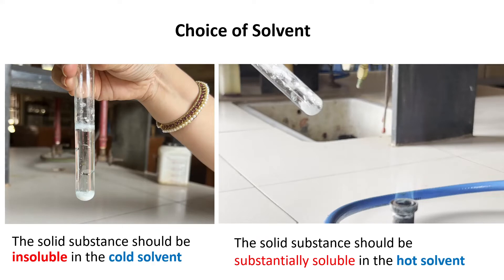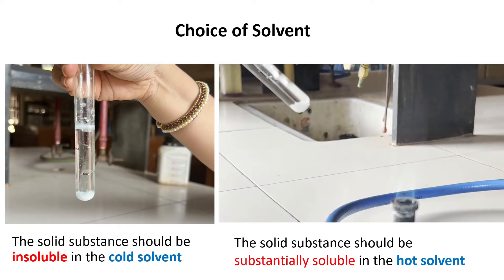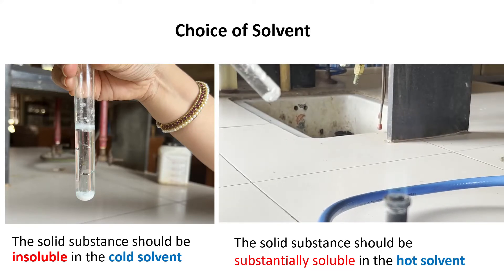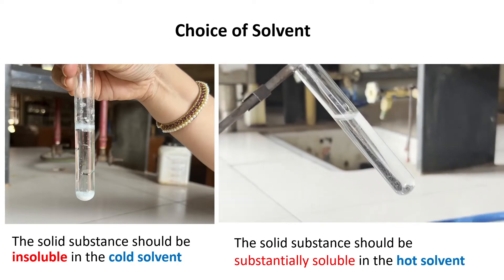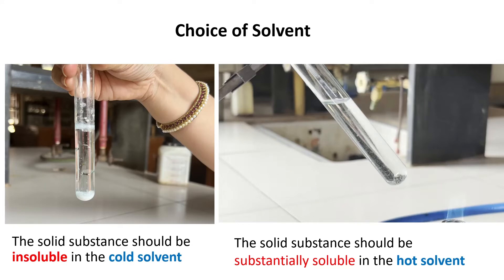The condition for the solvent to be used for recrystallization is that the substance we want to purify must be insoluble in that solvent under cold conditions, but should be soluble under hot conditions. Here I have taken a substance to be purified in a test tube and added half a test tube of water. You can see that the substance is insoluble under cold conditions. Now I will start boiling this solution, and you can see that the substance gets dissolved. This means I can use water as a solvent for purification of this particular organic compound. Generally used solvents for purification are water, aqueous alcohol, or alcohol.